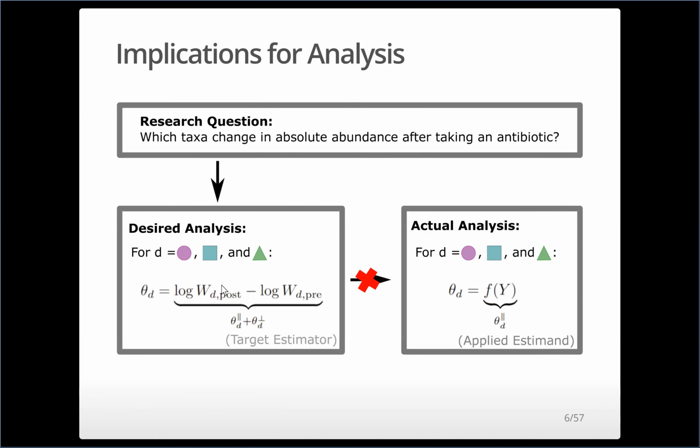We're actually doing some analysis that's a function of our sequence count data. It isn't what we want. It's not necessarily answering our question per se. And how well it's answering the question depends, one, on what the question is, and two, what kind of analysis you're actually conducting, right? Are you using ALDEx2? Are you using DESeq2? Each of those are going to make some assumptions to bridge that information gap that we talked about in the last slide. Does this all make sense to everyone so far?